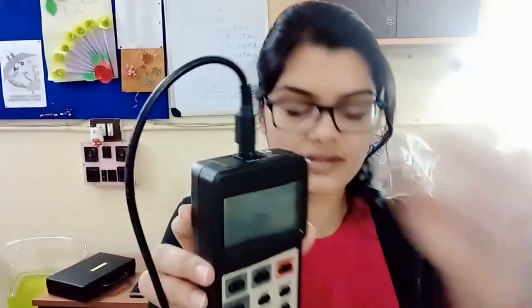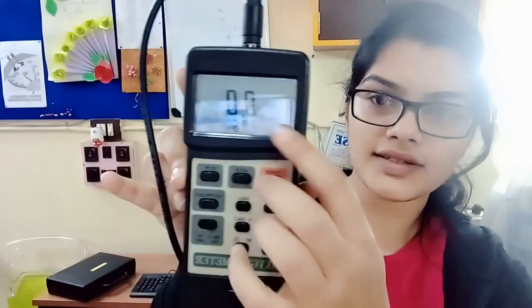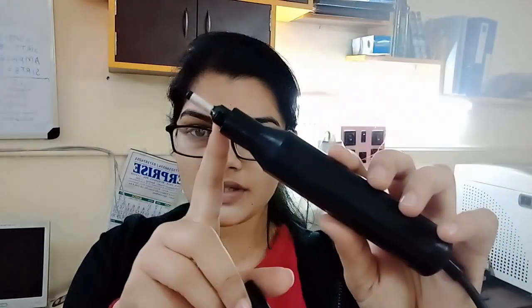This is the connection of the probe to the monitor, and we get the reading here and the temperature here. So this is the probe which can be opened. This portion we dip into the water, and this wire is connected to the main monitor here.